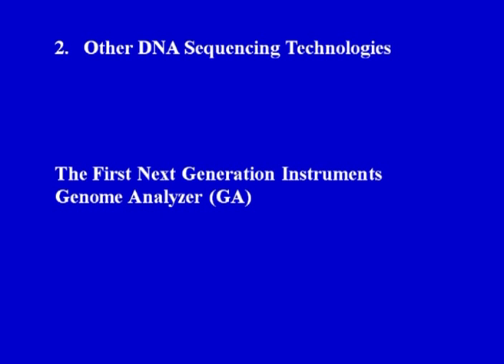Then there are other DNA sequencing platforms, like the first next generation instrument, the Genome Analyzer, developed by Solexa Inc., which was later purchased by Illumina. It utilizes a strategy for massively parallel DNA sequencing, whereby individual DNA fragments with appropriate linkers are first amplified on a slide matrix similar to a microscopic slide using a solid phase PCR process.